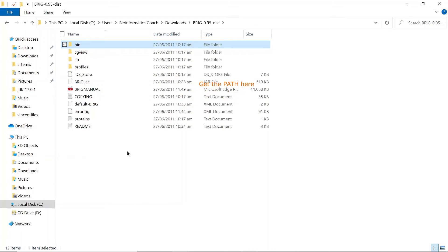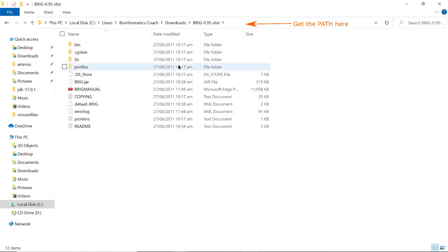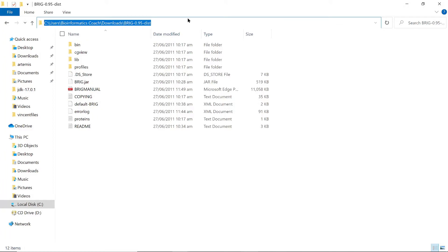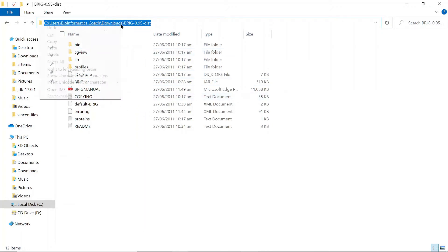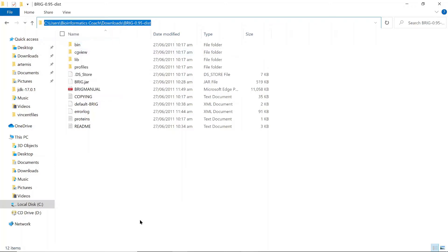What you need to do first is to get a path—that's what I recommend for you to do. On this bar here where you have your path, Local PC, blah blah blah, just click on the right side here, any empty space on the right. You have some text being shown here for you. This text is the path to the BRIG.jar file. Just copy this path, copy it, and that's it.